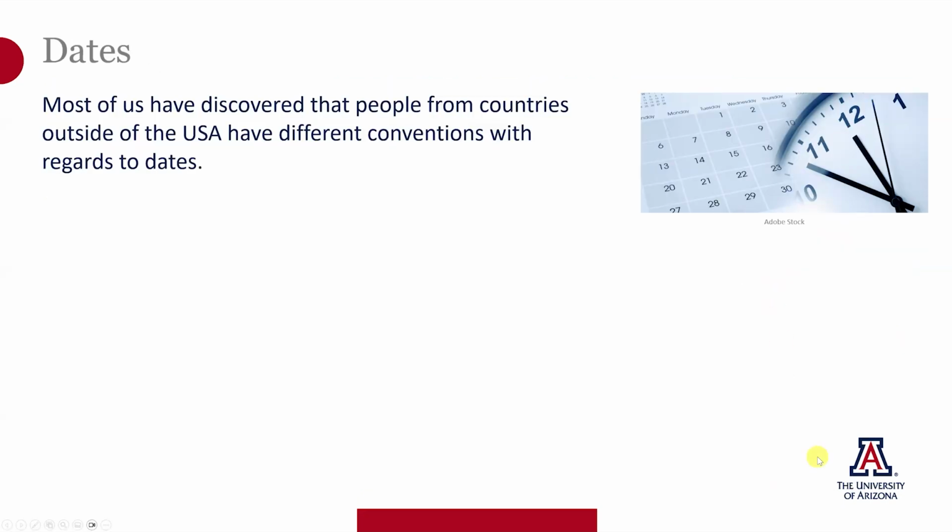I'd like to take a moment to talk about date formatting. Most of us have discovered as we work with people from other countries that are not part of the United States that there are different conventions with regard to dates.